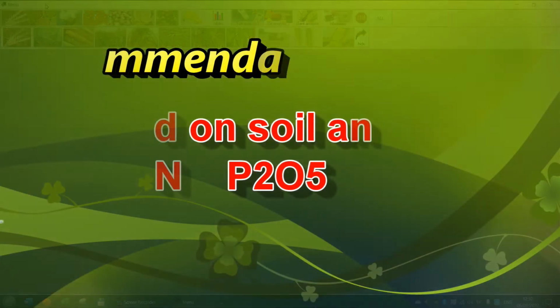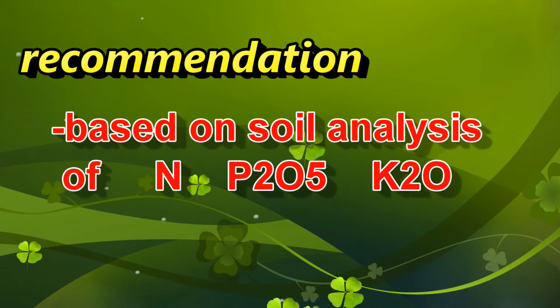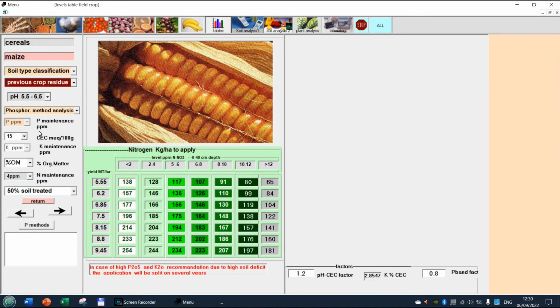And now we move to the soil analysis and recommendation based on the analysis. Here, for instance, we shall decide about the soil type. Here, okay, sandy loam. If we had some residue from previous crop, what is the level of the pH? Let us start, for instance, a soil which is a neutral soil.